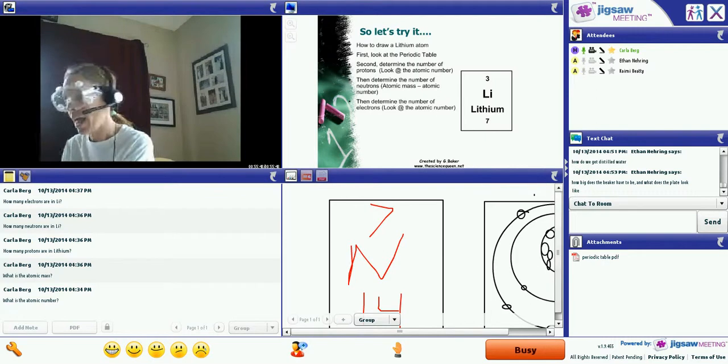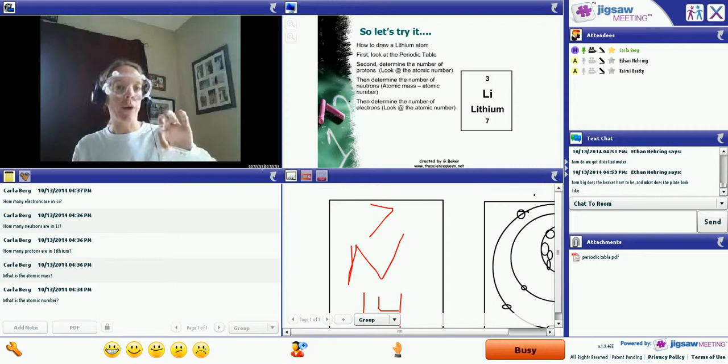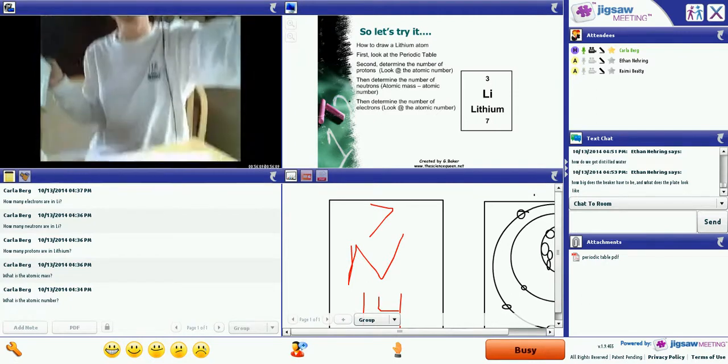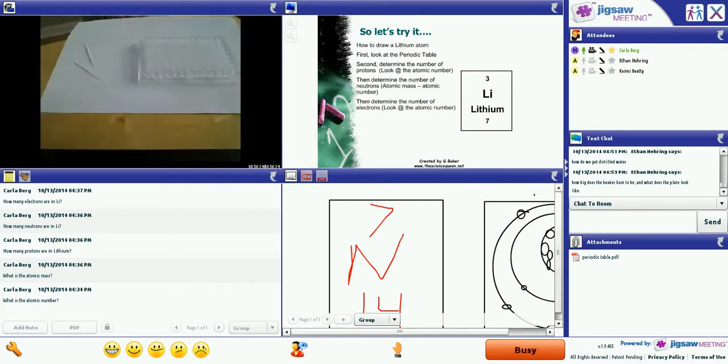If we look at number 1 in A, it says, it will be easier to observe the precipitates if we use column 1. So column 1 is going down the right-hand side of your well plate. It is labeled 1. Okay, columns go top to bottom. Let me change this so you can see me, hopefully. Columns go top to bottom. Rows go right to left. So if we are working in column 1, add 1 drop of copper nitrate. So find your copper nitrate.